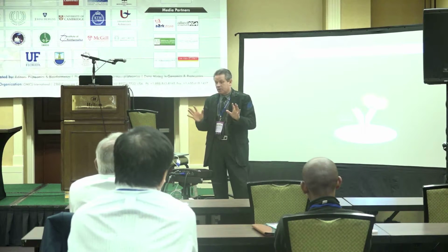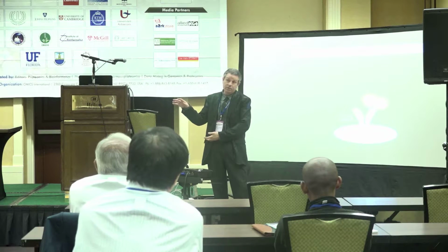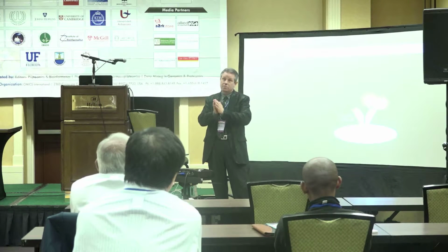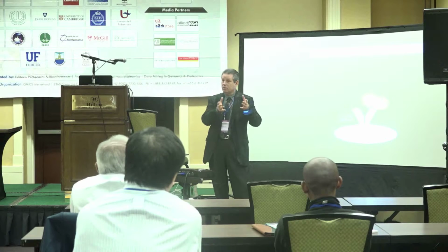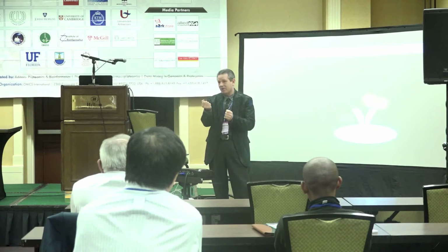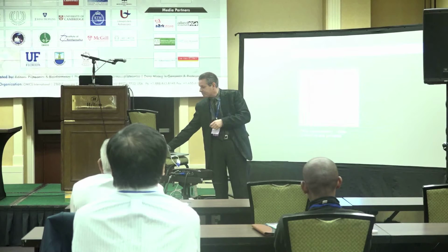The way we deal with this problem is that for all of the antibodies that are on the microarray, we run them through a series of different types of lysates, and then we calculate and provide as part of our reports the lowest signal ever recorded, the highest signal recorded, the median signal, and the average signal. So you get a sense, when you get a signal back for your lysates, whether this is really a strong signal for that particular antibody, or whether that is as good as it gets. Yeah.